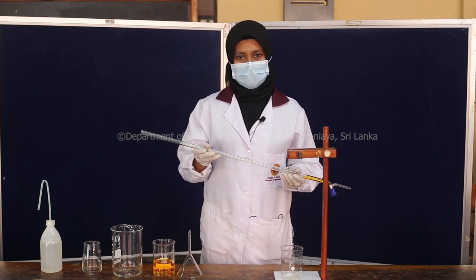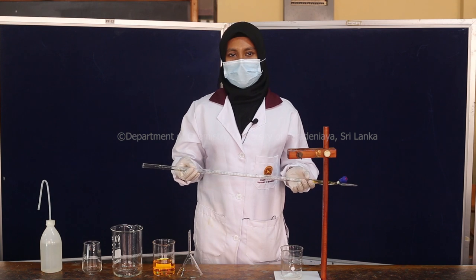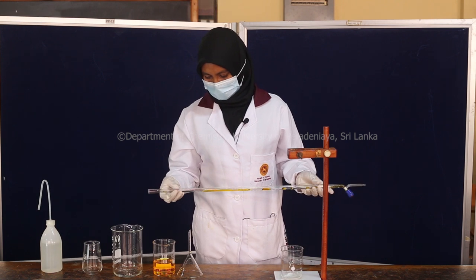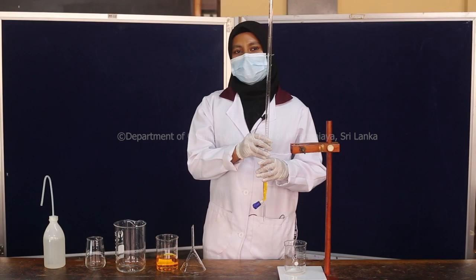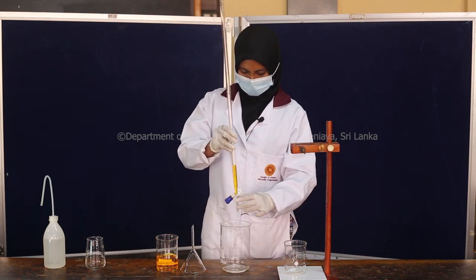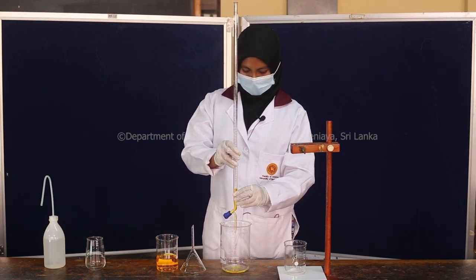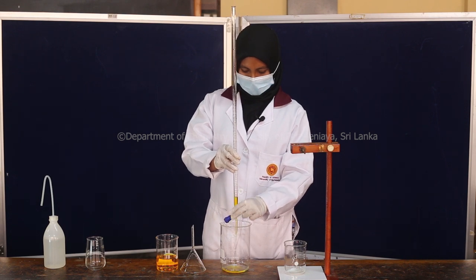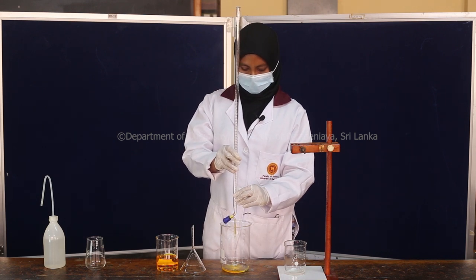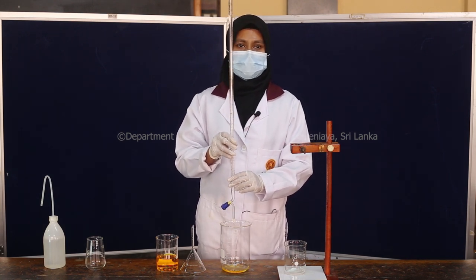Tilt the burette in a horizontal position and rotate the burette using your fingertips in a way that the entire inner wall of the burette gets rinsed with the solution. Then discard the solution to a glass beaker. Now fix the burette again to the burette stand and make sure that it's not tilted.